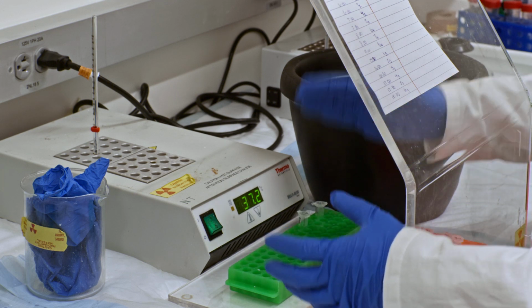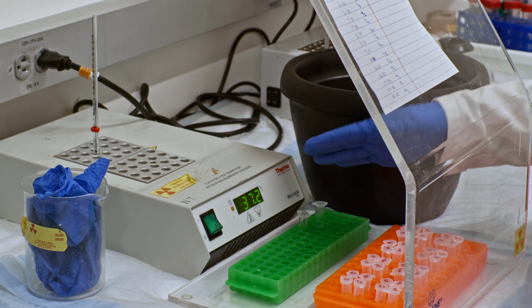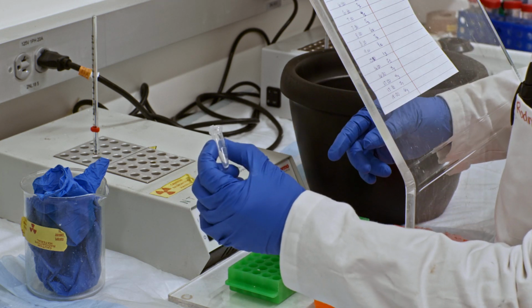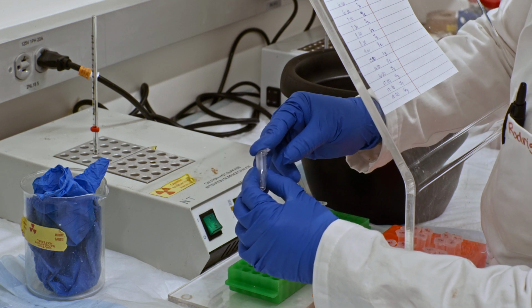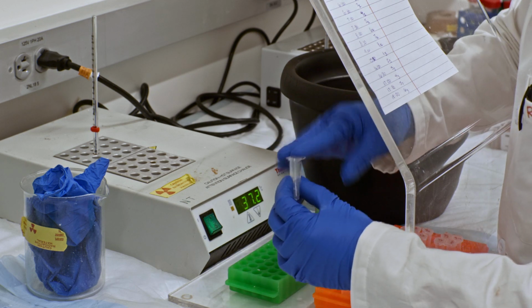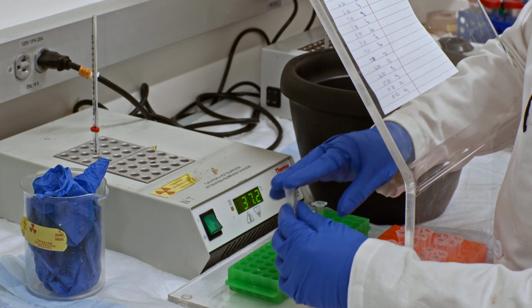The only time you have to actually take your samples back here is when you're ready to start adding radioactive DNA. While you're outside, these little reaction vessels here are about 30 microliters in total volume after you've added all the components you need to add. This contains currently just the reaction buffer for the enzyme that you'll need to run the reaction in.